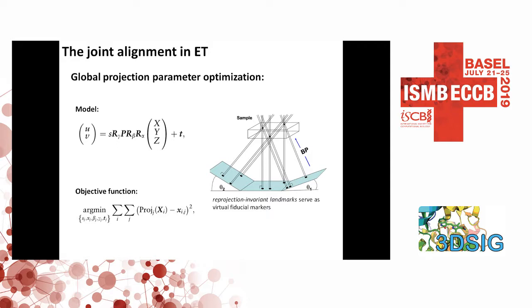Yeah, I know that usually people use a single rotation axis for the tilt series, but sometimes we can find that there will be pitch angles. Okay, and this also incorporates general translational affine transformations? We just start from this model. We don't fix the rotation angles.